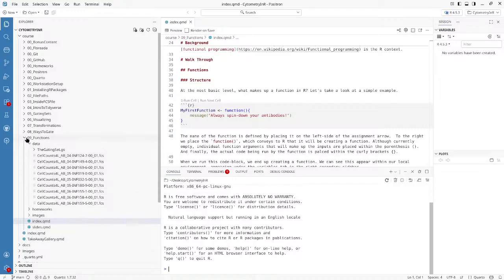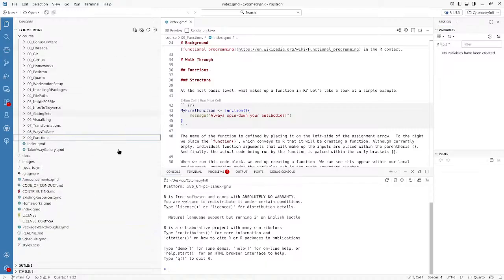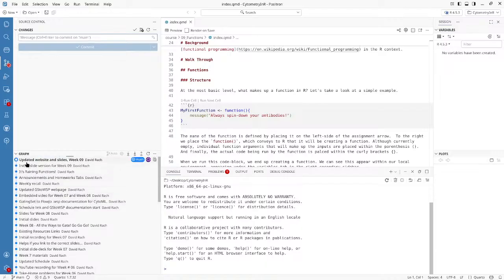The main reason I'm emphasizing not working within this project folder here for your local fork version is, let's say you end up creating a couple new files that are located right here, and then you save them and put them into a commit. Now you are no longer following the same cycle when you're looking at the commit messages. Instead of tracking exactly with all the commits that are present from the course, you're now on a little parallel branch, which can cause some issues, as many of us who were trying to submit the homeworks under the old protocol encountered, where you're getting merge conflict issues, which are just generally a pain to deal with.